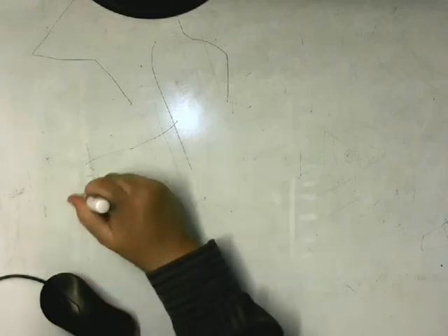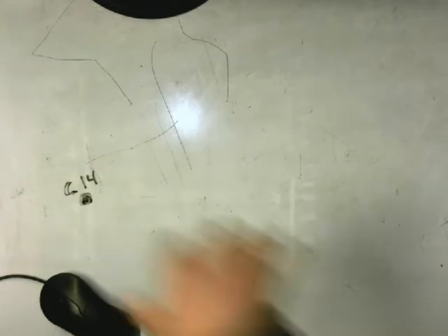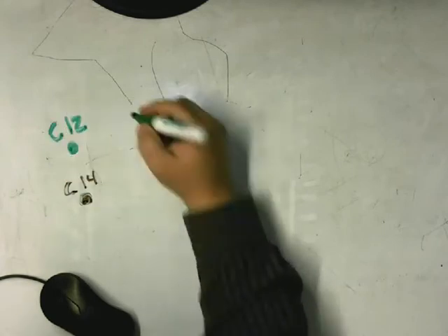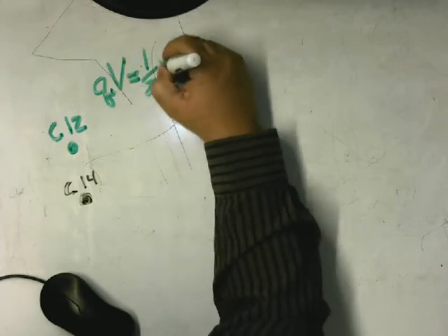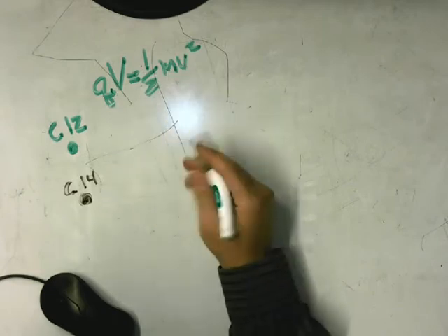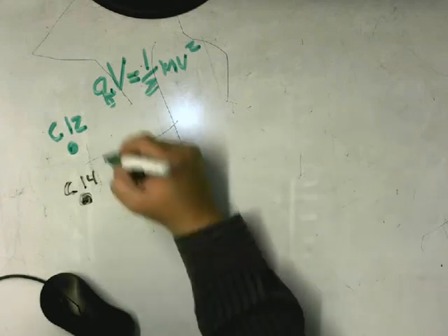So in the second part, we had a carbon-14 and a carbon-12 that were pushed through my accelerating voltage, and they were given a particular amount of energy. Each one of them has the exact same amount of energy, but as we talked extensively, they don't have the same amount of velocity, this being voltage, that being velocity. So as they travel through the next section, I can select out particular atoms.